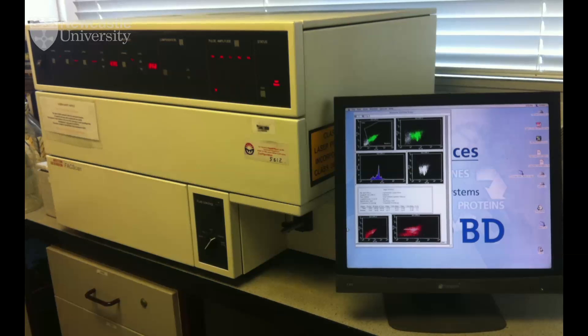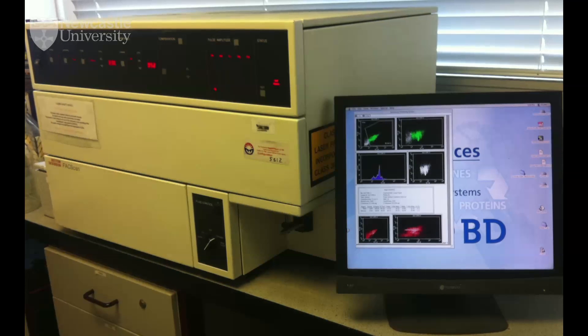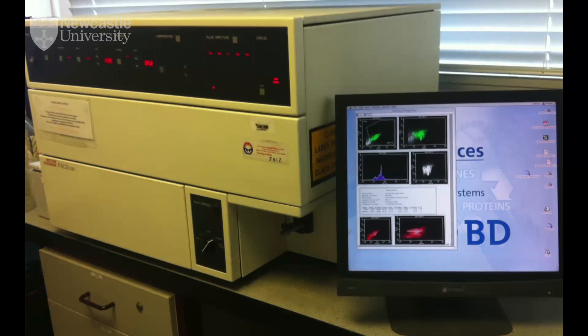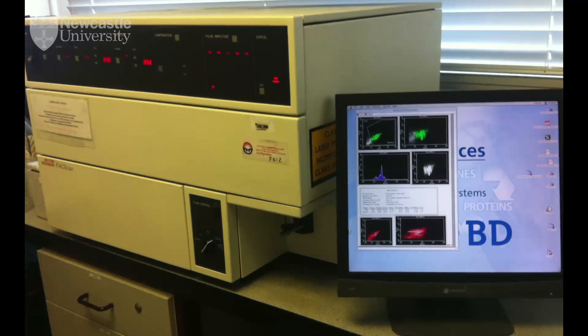Alternative counting methods, including the use of flow cytometry, are available as relatively inexpensive and straightforward methods for determining the concentration of bacteria in an aqueous sample.